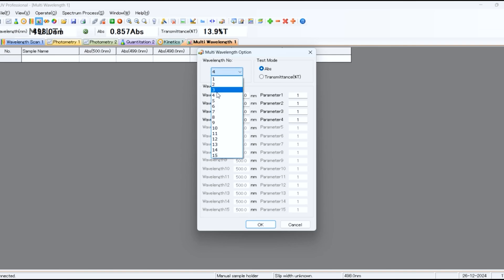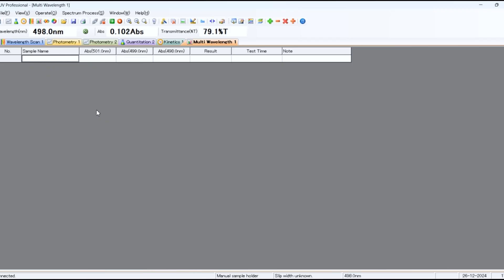Select multi-wavelength and input multiple wavelengths. Blank the system, insert the sample and click start test.